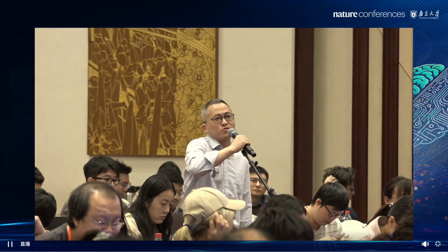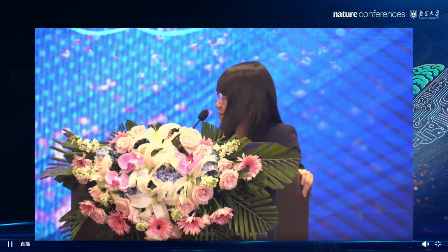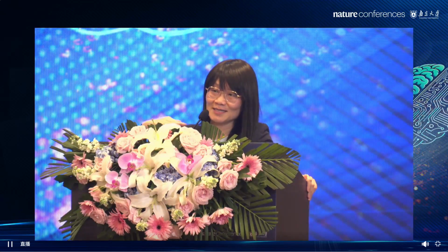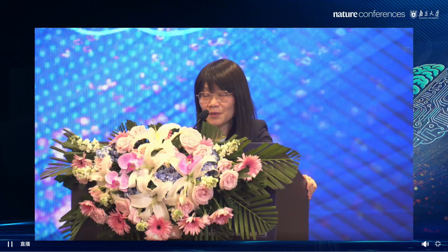And a further question is, after integration, can you build up a 3D model? Yes. So with spatial, we can only look at one 2D section. So it's very important to obtain many slides from the same tissue samples and then computationally integrate them to construct 3D spatial omics. A lot of methods have been developed and a lot of papers have been published.